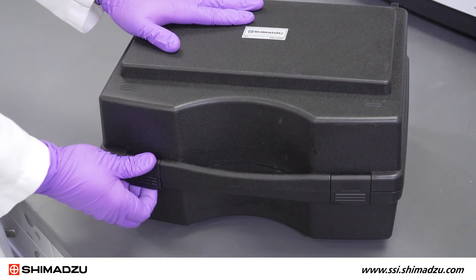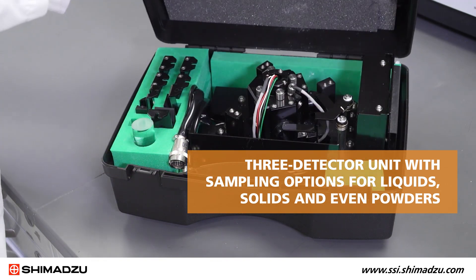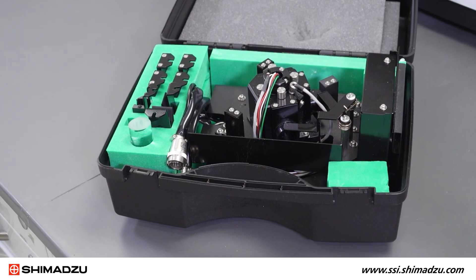The integrating sphere for the UV-3600i Plus is a three-detector unit with sampling options for liquids, solids, and even powders. The detectors are all housed inside the sphere.